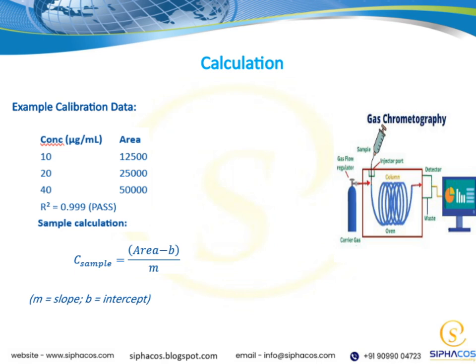This way, we can accurately interpret new data based on this established relationship. Understanding this calculation is essential because it underpins the entire calibration process, ensuring our measurements are reliable and consistent. So, by thoroughly grasping how m and b work together, we can accurately translate raw signals into useful information, which is the core goal of calibration.